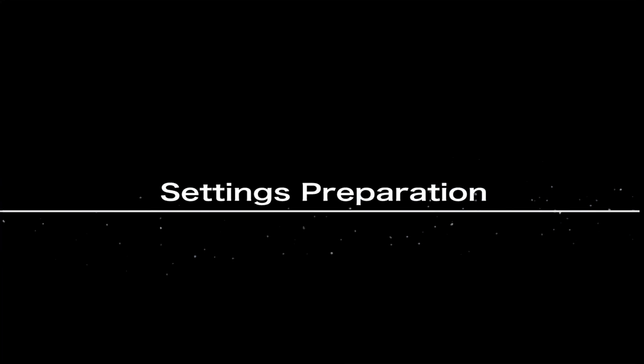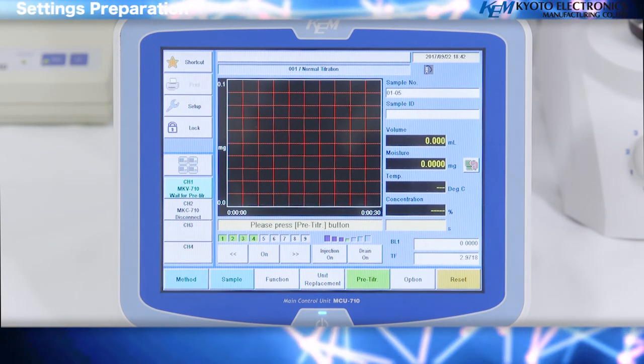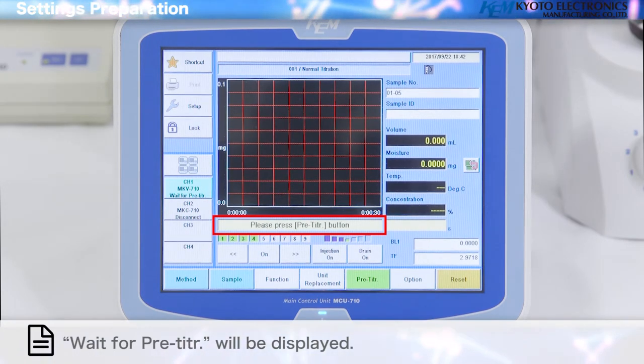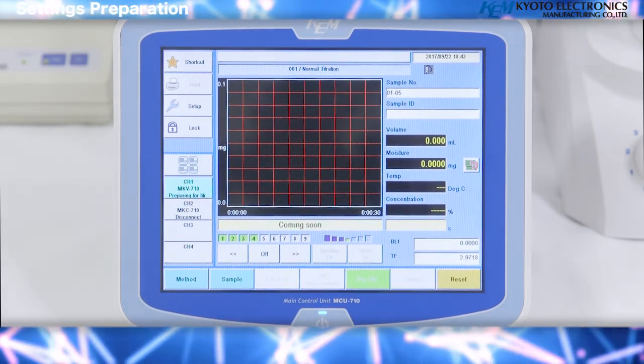Settings preparation: First, carry out a pre-titration to dehydrate the titration cell. A 'Wait for pre-titer' message will be displayed. Press the Pre-Titer button to start the preliminary titration.